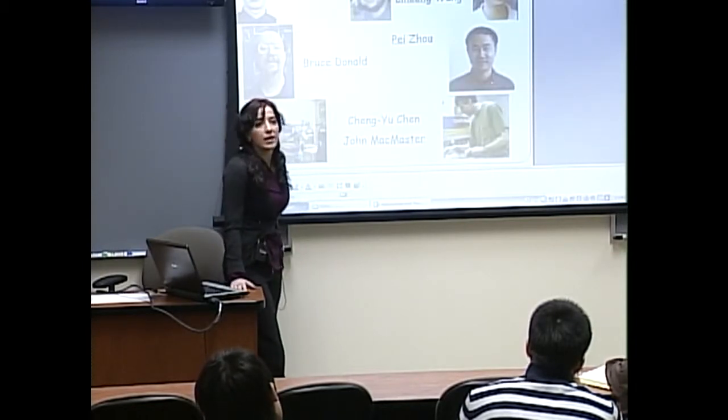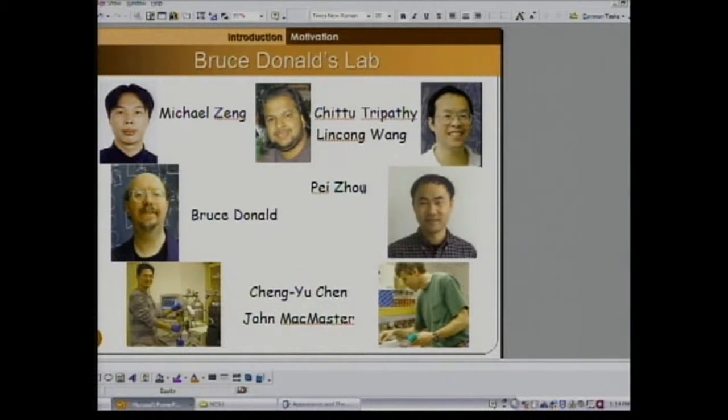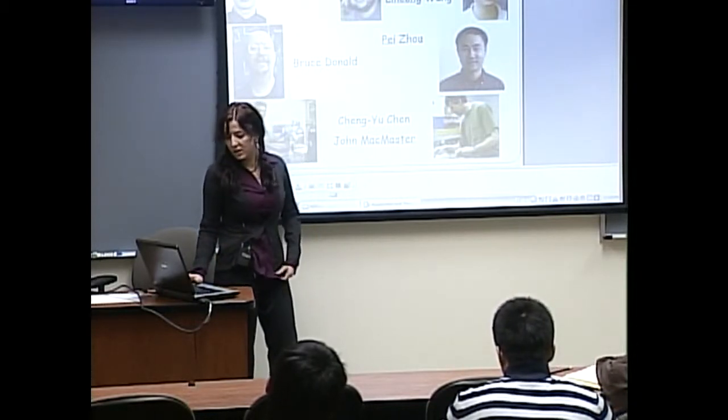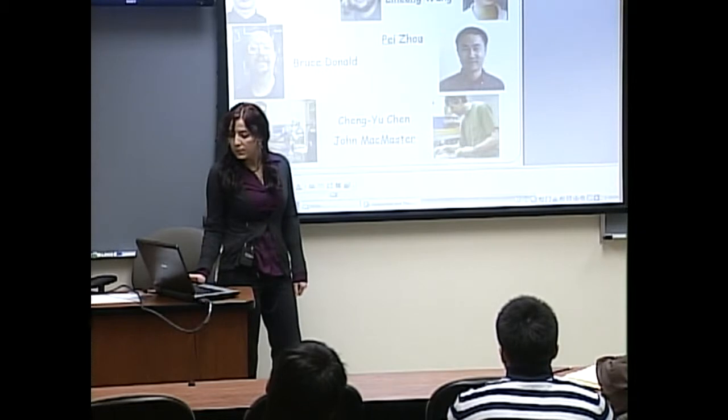This is part of our lab. Bruce Donald is the PI. We have a collaborator, Peizo, in biophysics. He helps with the spectrometer and collection of the data. We currently have 2 graduate students who are biochemists. They actually do the experiments in the wet lab, purifying and expressing proteins. And we have 3 students in the computational part of the lab. And this is only an NMR project. We have more students and postdocs in the drug design project of the lab as well. But this is the NMR structure determination part of the lab.